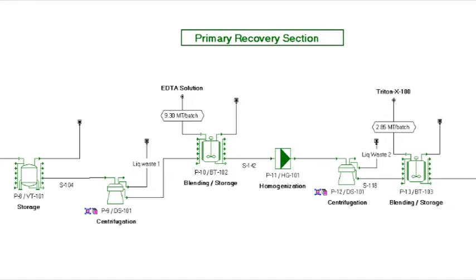Operation Unit 13: Blending Tank BT103, another blending tank. The inclusion bodies are recovered in the heavy phase with a yield of 98%, while most of the cell debris particles remain in the light phase.